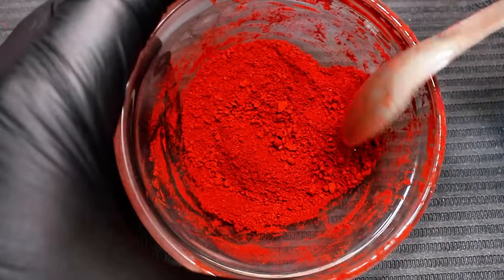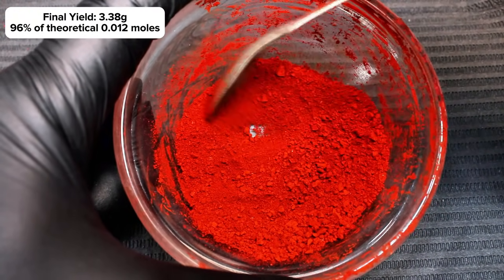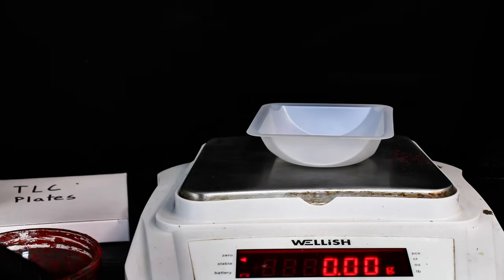Once my para-red was completely dry, I weighed it for a final mass of 3.38 grams, representing a 96% yield. This was pretty good, and in general these types of reactions are very high yielding.